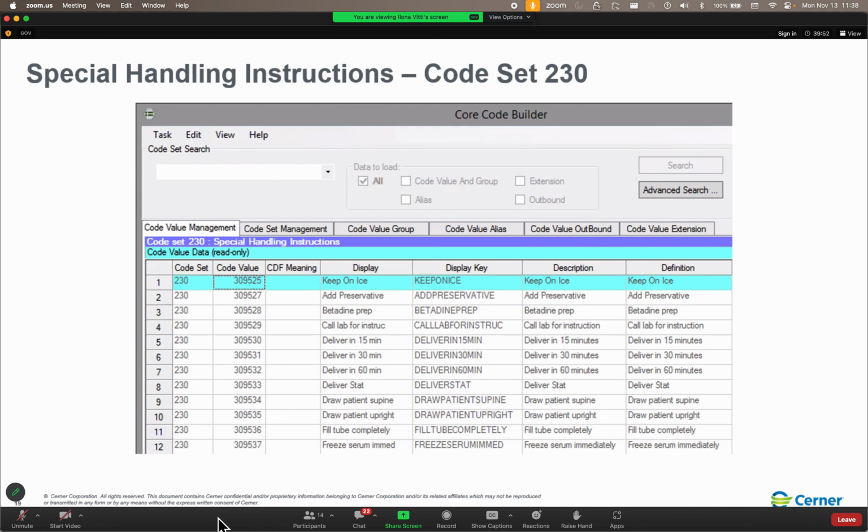My lab handling instruction is going to be, see, I'm already telling you to dance and jig. Maybe I am going to say, hold up to... Press tab to tab out of that display field.